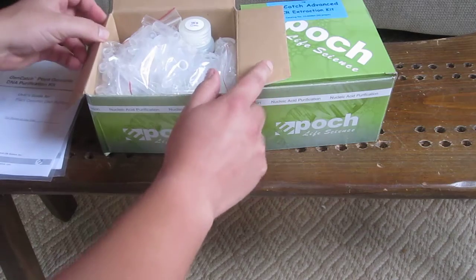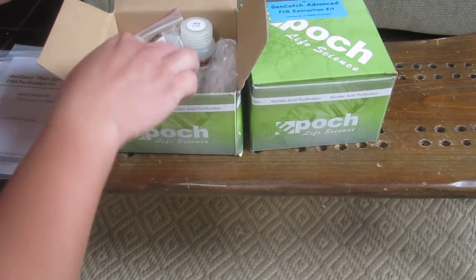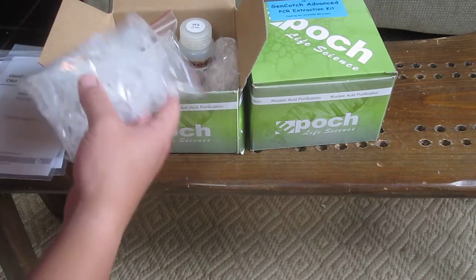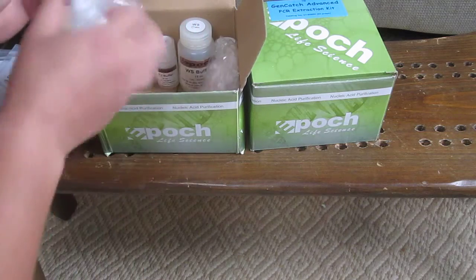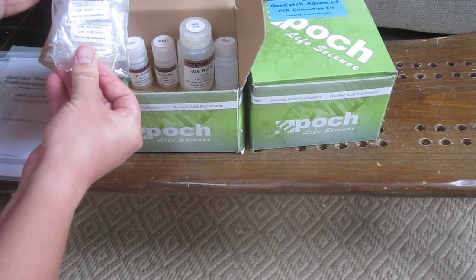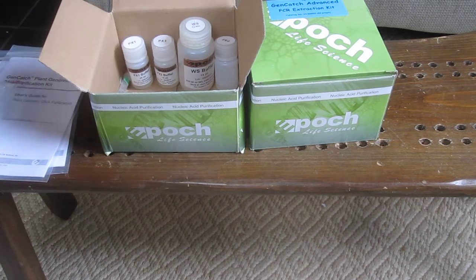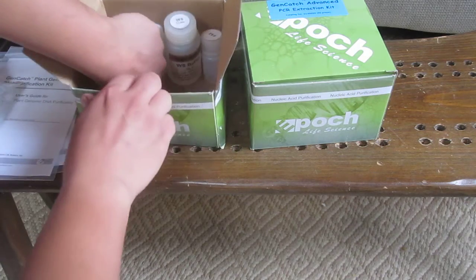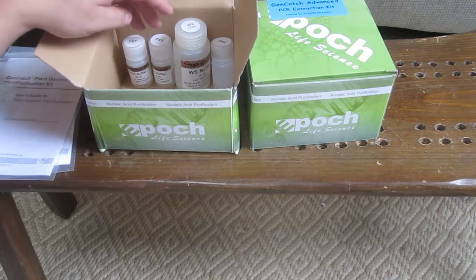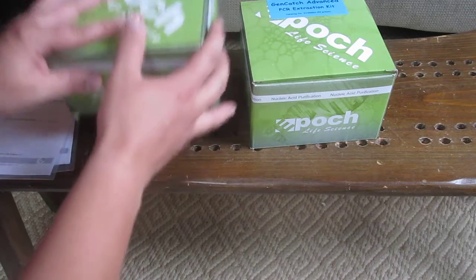So the plant genomic DNA kit from Epoch, which we're going to use to barcode fungal samples for endophyte research — you have some collection tubes, some more collection tubes, a shearing tube with a silica column, and some more plant genomic DNA mini columns with the silica bottoms. You also have some RNAse here in the corner, which you'll add to one of the buffers, some lysis buffers, elution buffers — all can be stored at room temperature. So that's a nice kit.